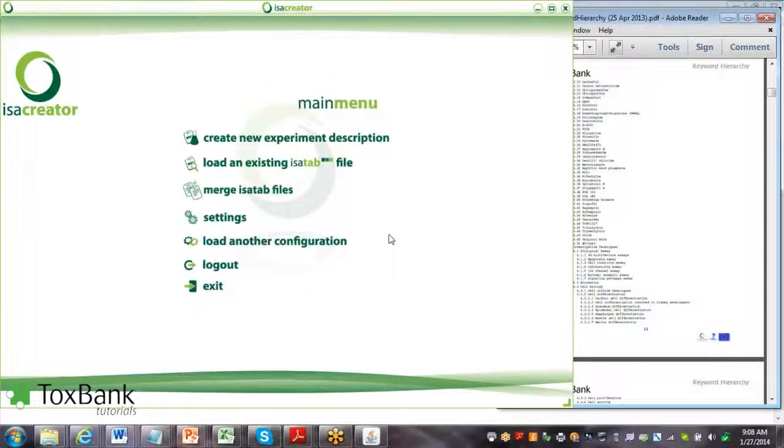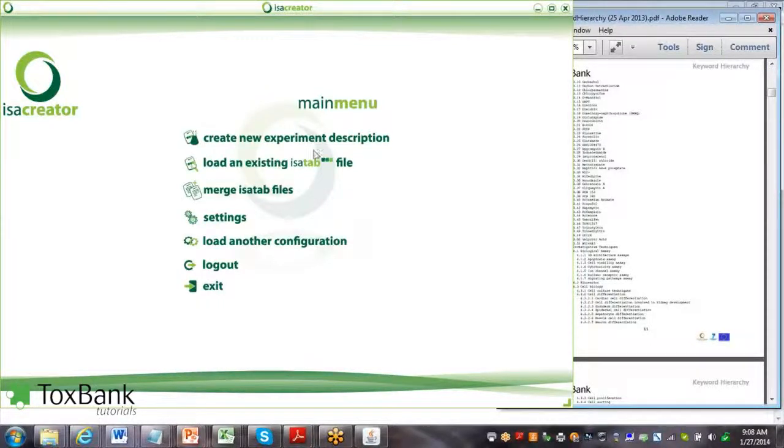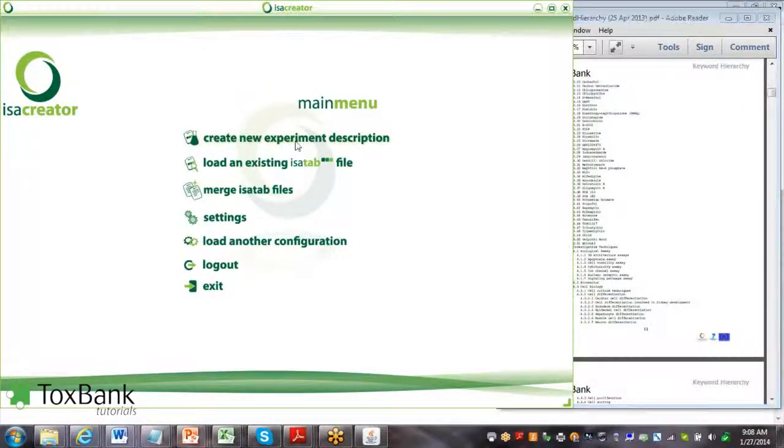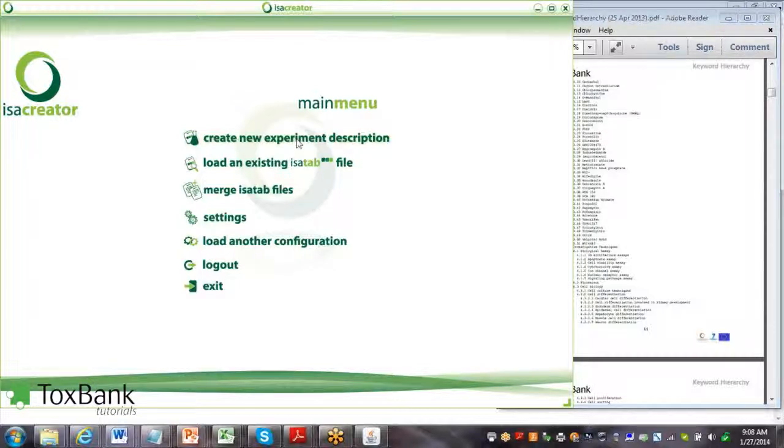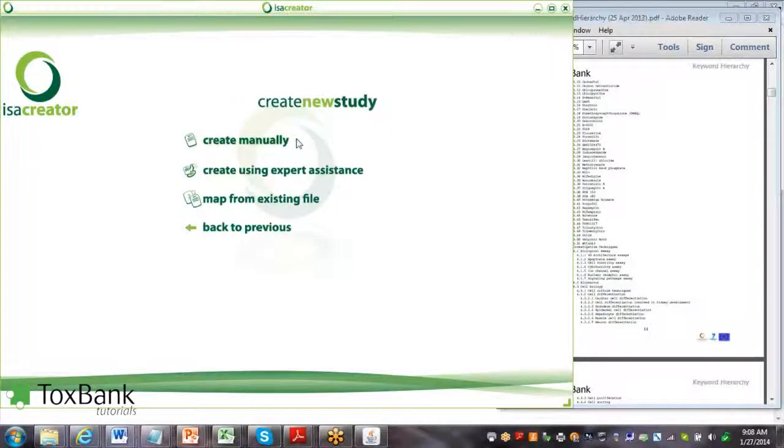The first step to manually creating an investigation is to select the first option, create new experiment description, and we'll create it manually.